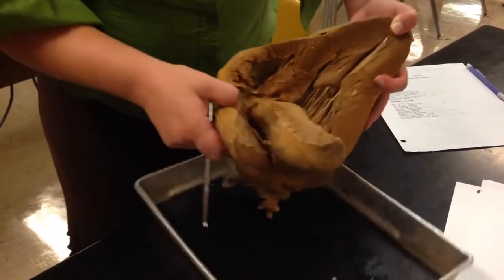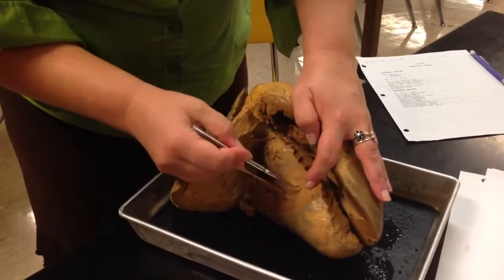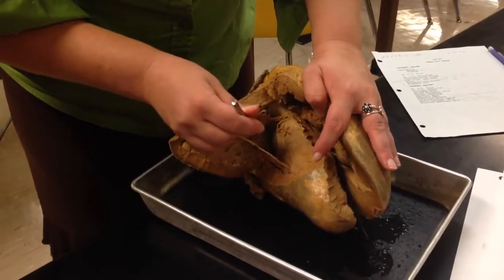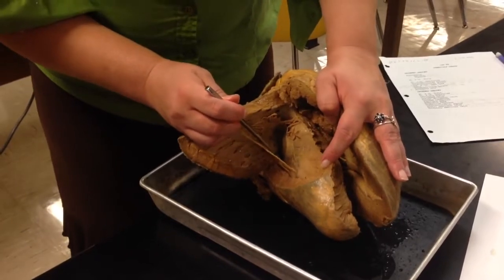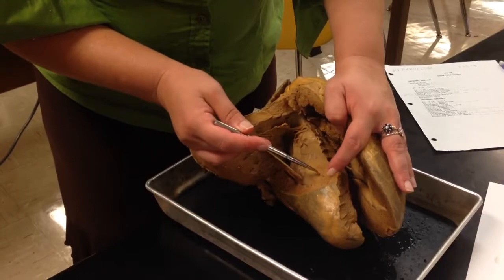Over here would be the right side. This one's cut a little weird, but this would be right ventricle here. And then if you go through the valve, that would be right atrium. And then the valve itself is the tricuspid valve. So tricuspid valve, right atrium, chordae tendineae, and right ventricle.